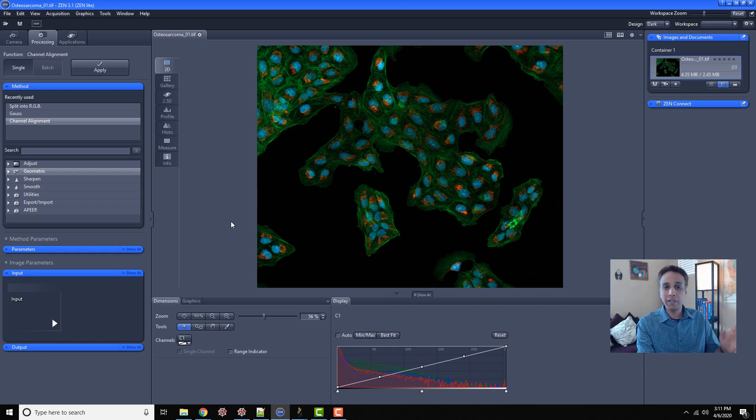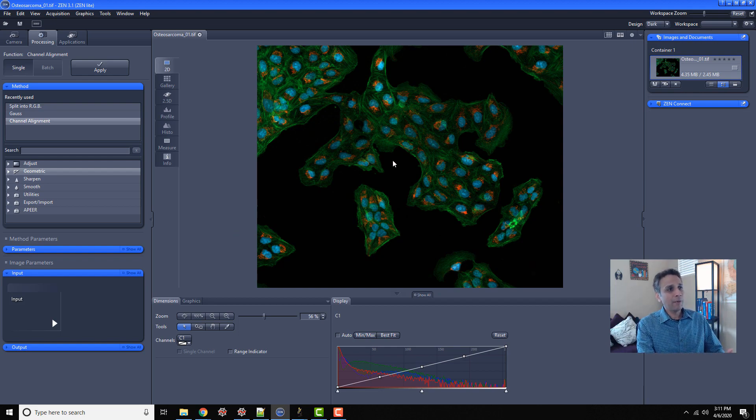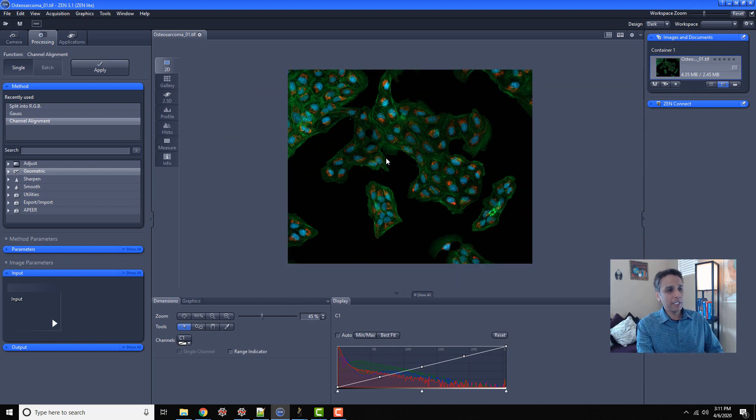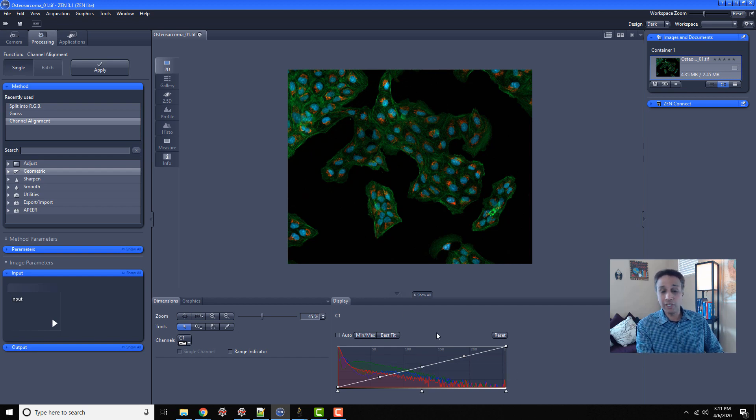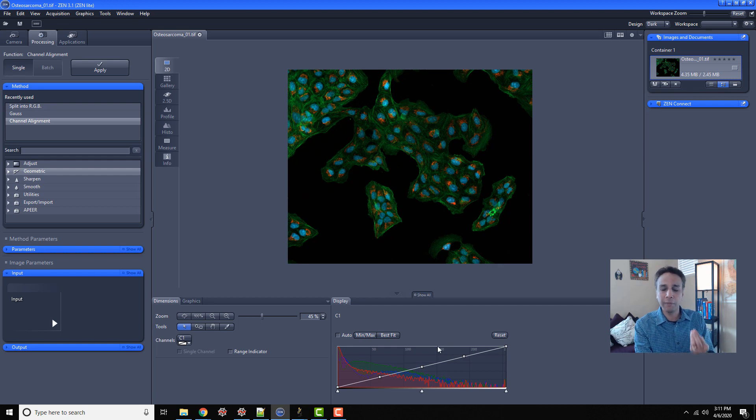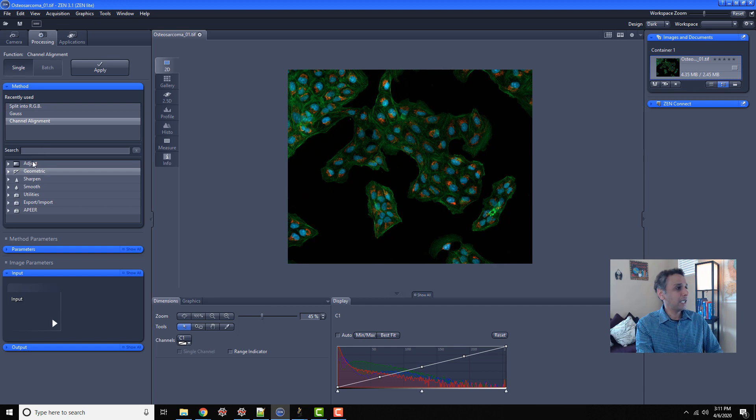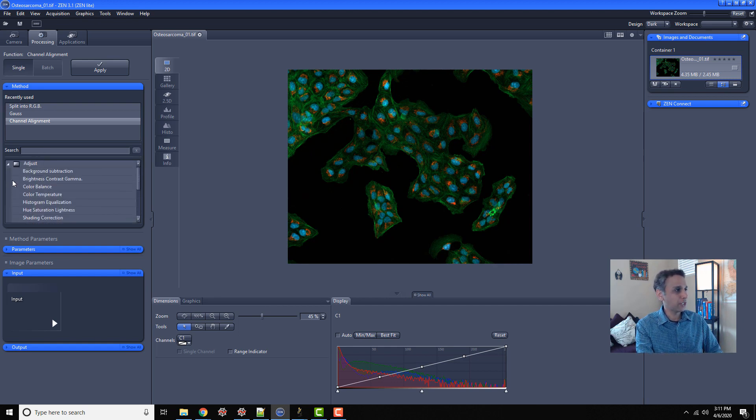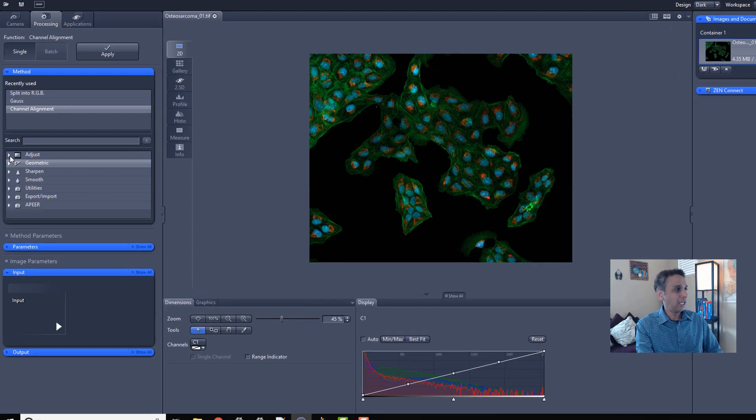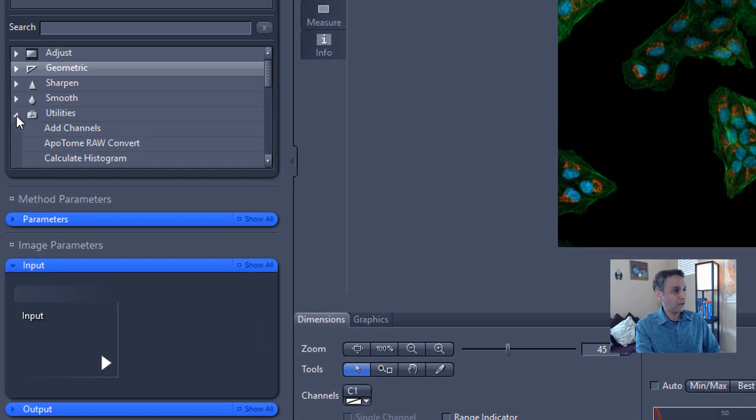So this is the free version. I'm not using any of the paid functionalities right now. Here it is. Now I have the same image, and down here you can see the histogram for red, green, and blue. You can manipulate the histogram for each channel, each color if you want. On the left-hand side, you can see there's a whole bunch you can do. You can adjust stuff, change geometric, sharpen smooth. A lot of utility functions are here.